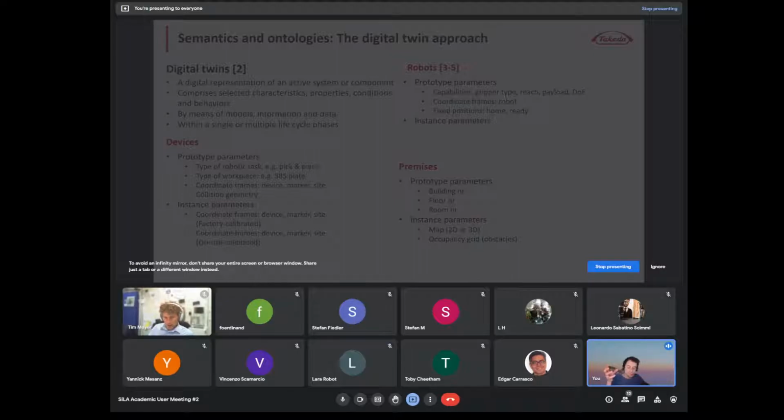Whereas in some use cases, it's important to be able to get to every possible orientation. And there, 6 or 7 degrees of freedom are needed. Also, the robot has some own frames, home position for when it moves, for example.